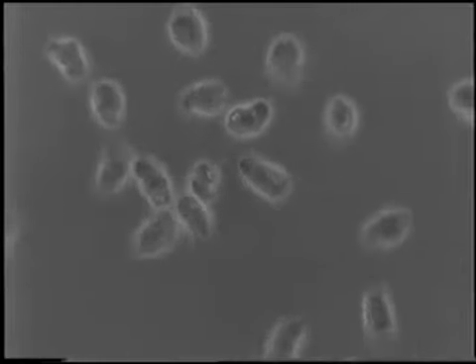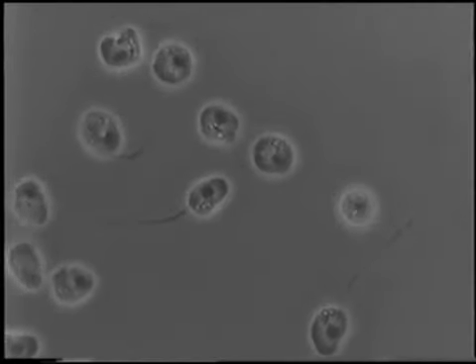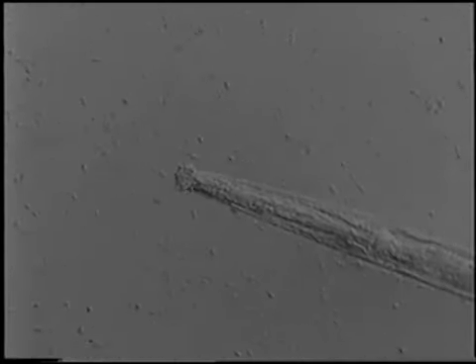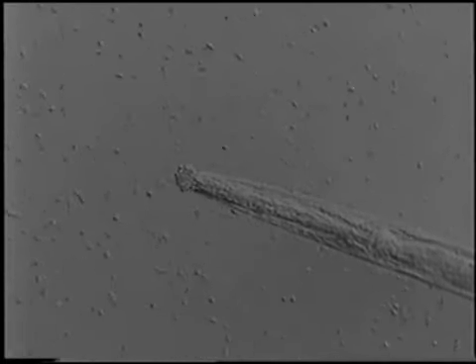The uniflagellate zoospores of Catenaria anguillulae are 2 to 3 micrometers wide and move rapidly in the water film on an agar surface. They are chemically attracted to nematodes and aggregate at the mouth or other natural orifices. Here the nematode Panagrellus redivivus has been immobilized by cold treatment.